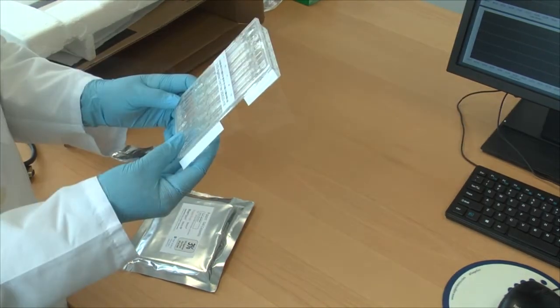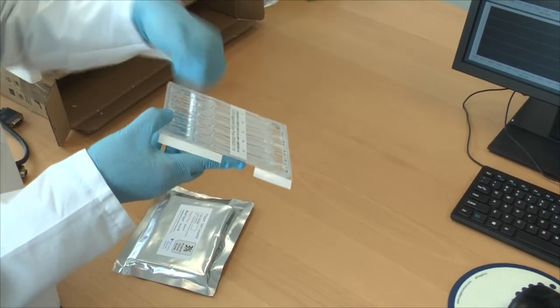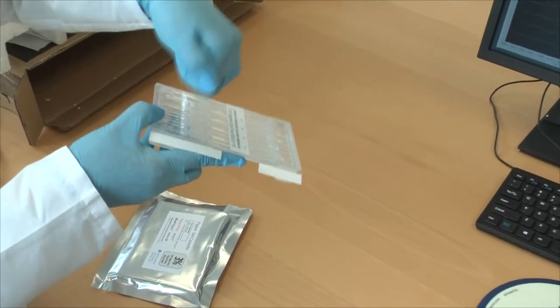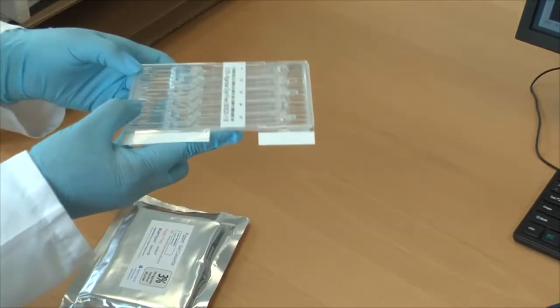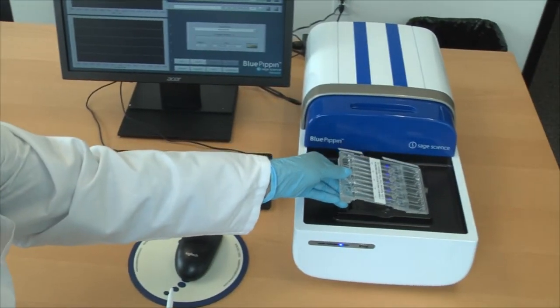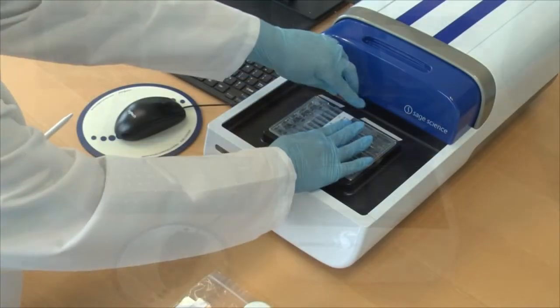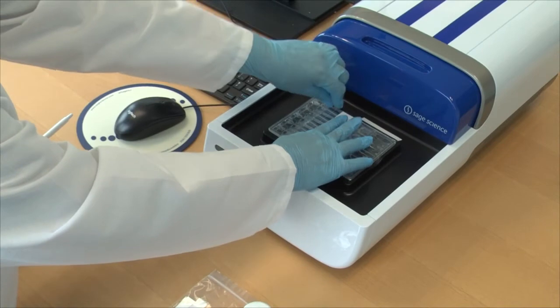The cassette is then manipulated to clear air bubbles from electrophoretic pathways and placed into the instrument nest where the adhesive tapes are removed from the cassette.